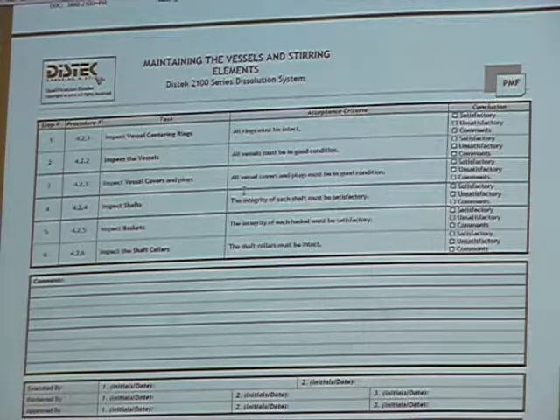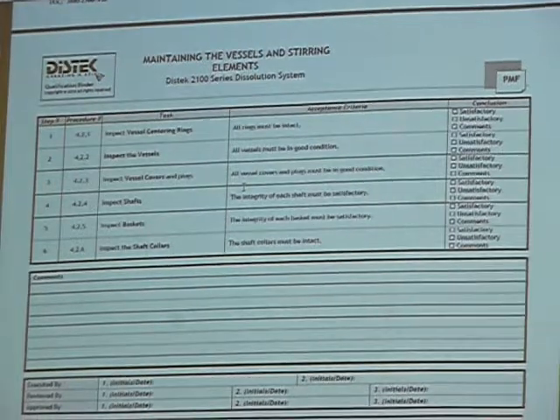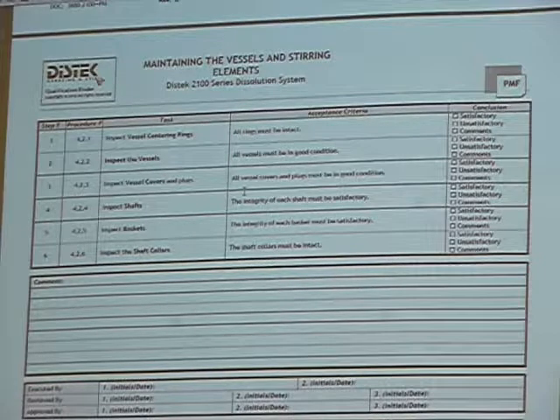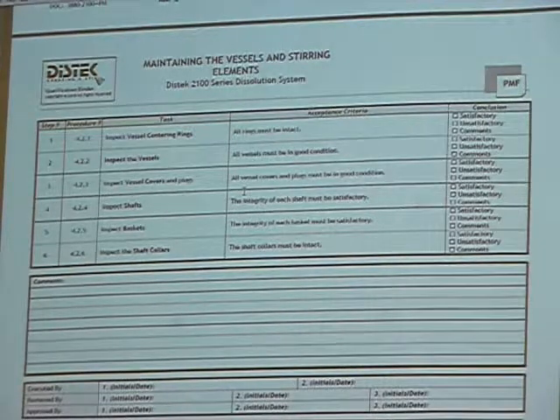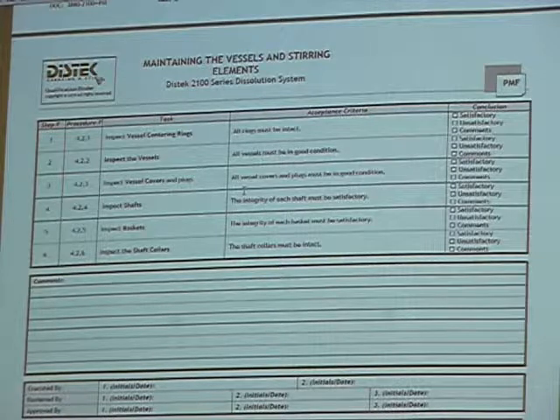Just inspecting. Some labs use cracked ones up on the top. I'm not so worried about that. If they're okay using it, I'll use it. I'm more concerned with any cracks or scratches down on the bottom, because if I'm going to do any kind of chemical testing, that could impact whether it passes or fails. Even though you do look at the outside, that can be grounds for changing it. But if it's cracked out here and they're already using it that way, I don't care. My only concern is down inside here, making sure there are no cracks, no chips, anything of that nature.